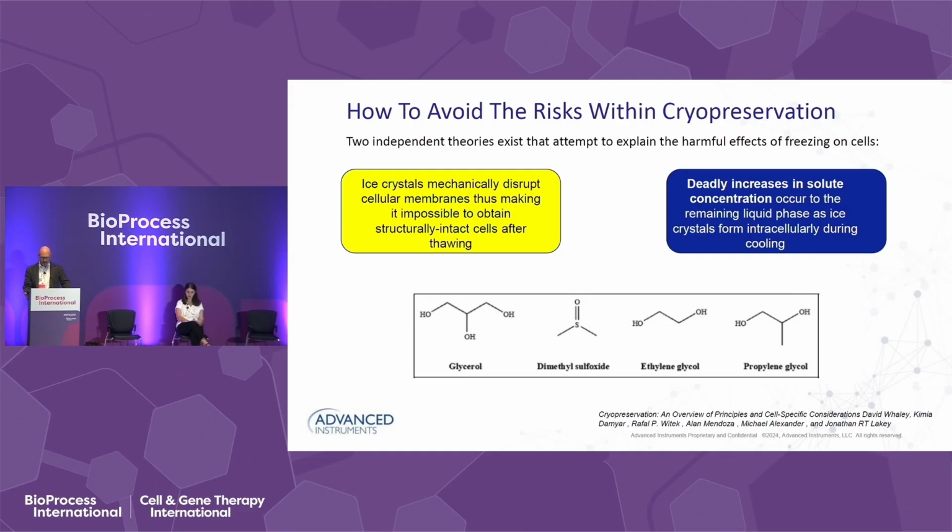A protected cooling and thawing process, along with an optimized cryoprotectant, is key to an ideal cryopreservation process, whether that's in your CLD banking or in your final fill and finish process. Osmolality can be the indicator of the solution specification in these cases, the optimal conditions, and then an indicator of an issue in the process if it occurs.